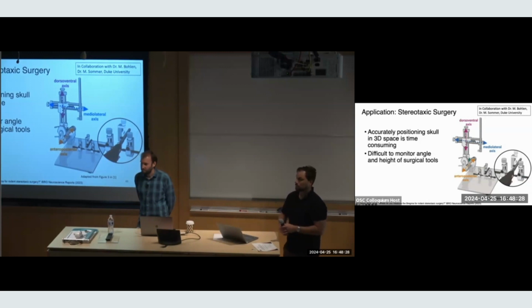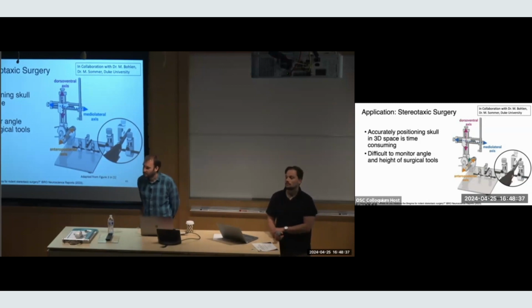Arrays of well-designed lenses for microscopy. Did you consider the possibility of using arrays of fiber bundles? Because you could construct lenses at the tip of one end of the fiber, and at the other end you can separate them from each other, so you can have multiple cameras on the other end. What are the advantages or disadvantages of doing that? Using a fiber bundle array to map lots of pixels to our sensors. It just seems a little tricky to do. We've done a few fiber bundle array projects, and in certain regimes they're really useful. I haven't worked on one where you take a large fiber bundle array and split it into smaller ones. I don't know how that would work, but I'm sure it's possible. It's a good idea.